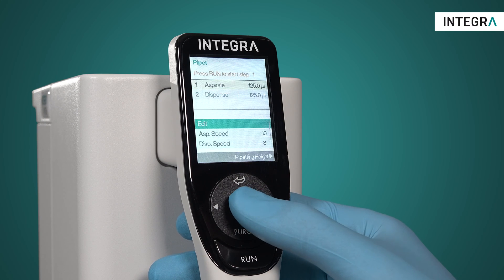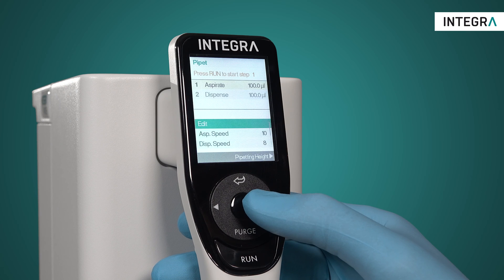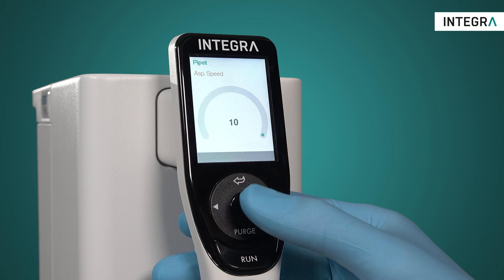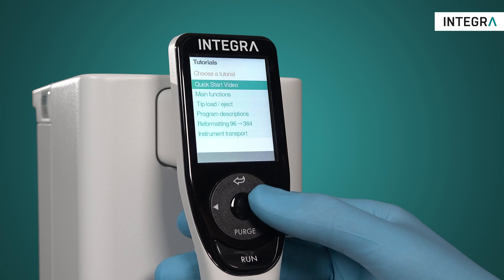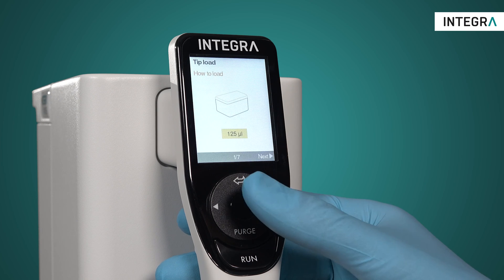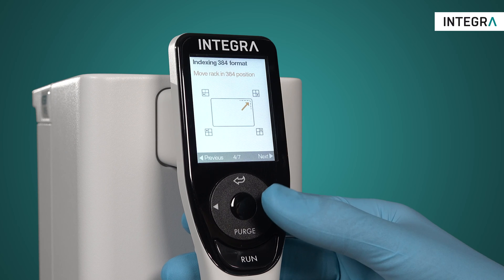Due to the simple programming, everyone who turns on the MINI 96 can quickly understand how to operate it. A large color screen guides you through all the steps, removing any guesswork. And for those who have never seen the MINI 96, convenient tutorials have been made to help answer any questions which might arise during pipetting.